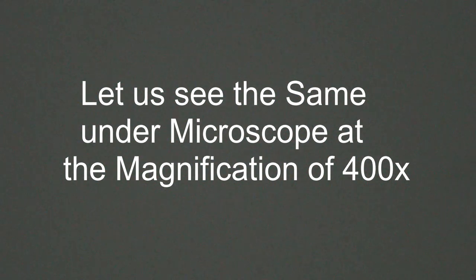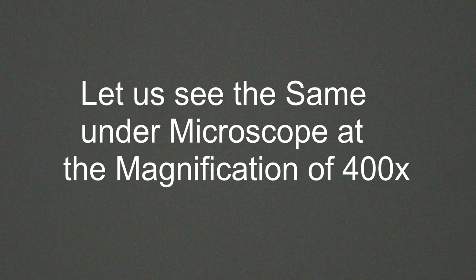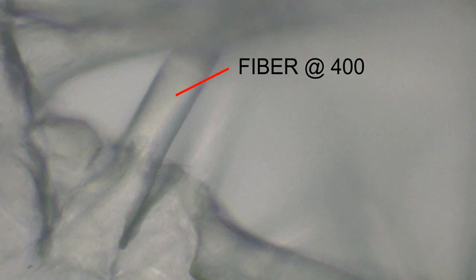We will be showing you the dimensions of the fibers which will be larger. This is the place where all the fibers are stuck. The dimensions of the fibers are quite large. The gap has also become larger, but this is due to the magnification. You can see the gap between the fibers is quite big.